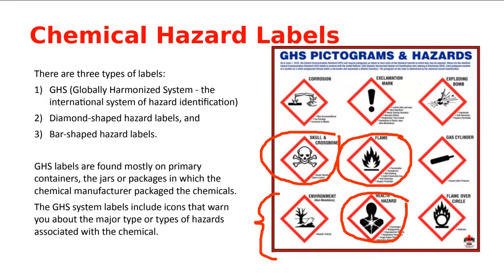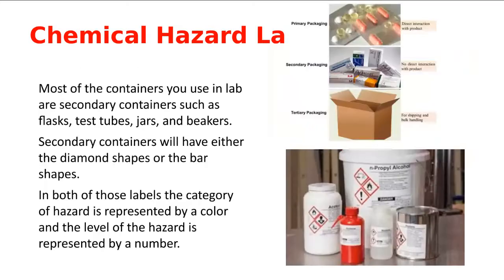All right. So the last topic I want to talk to you about is packaging. And so this is containers that will hold reagents or in some cases active drug product. So what I want to let you know is the container that is holding the substance is a primary container, right? That container can be put into another container to protect that particular substance from handling or whatever, okay? That's called a secondary container.